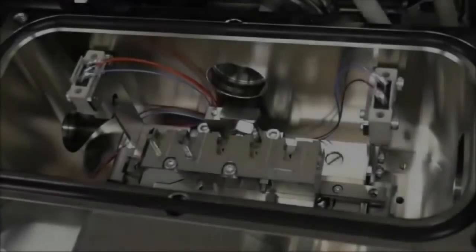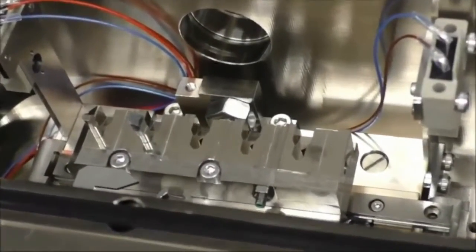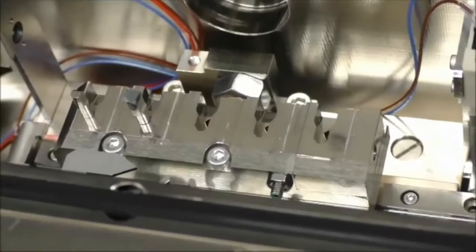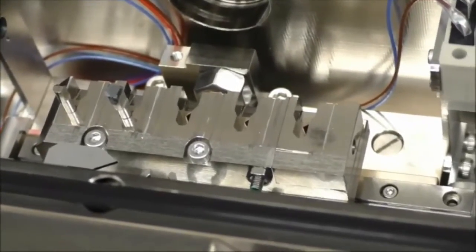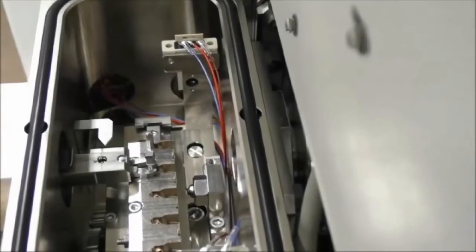The NX9000, which is a FIB-SEM system, is quite unique. Our engineer is loading multiple different types of samples into the exchange chamber.